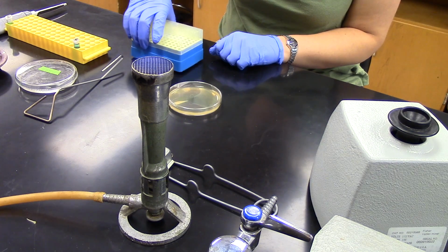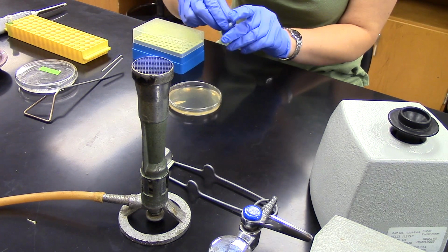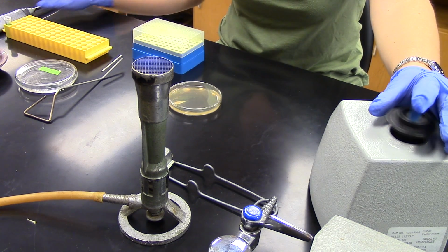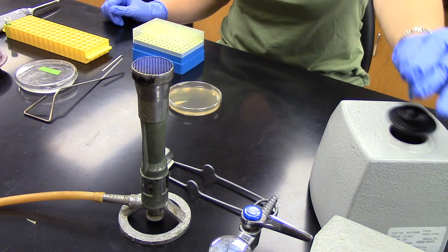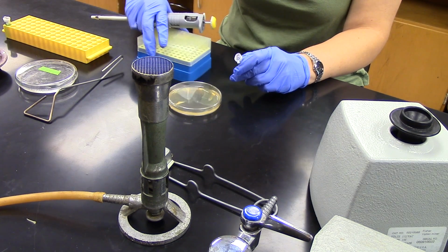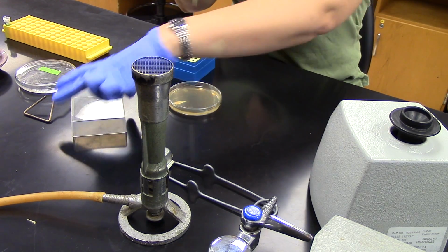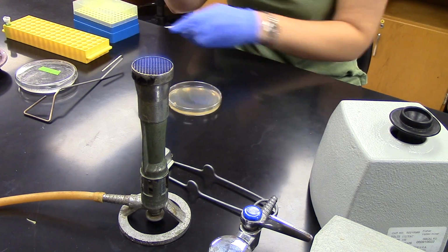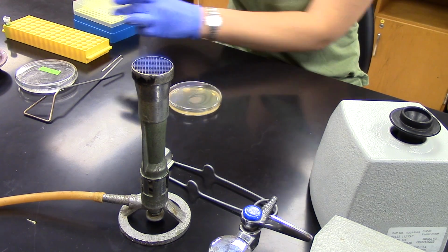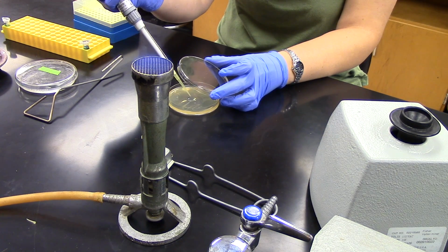Here we're going to just use green stuff to plate because maybe you'll be able to see it. But when you're using bacteria or yeast, before you plate, you vortex them. Otherwise, they might have settled to the bottom and you won't pull out anything. So you pipette out however much you need to plate. Remember, sterile technique, so keeping lids on things as much as possible to avoid air exposure. And just squirt it onto the center of the plate.